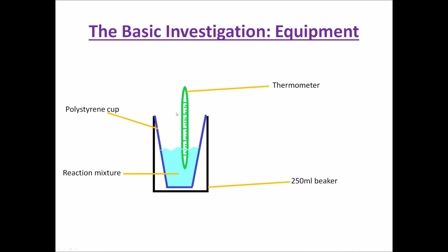Okay, so we can stir with the thermometer so long as we're careful, because obviously polystyrene is quite fragile and we don't want to break it.